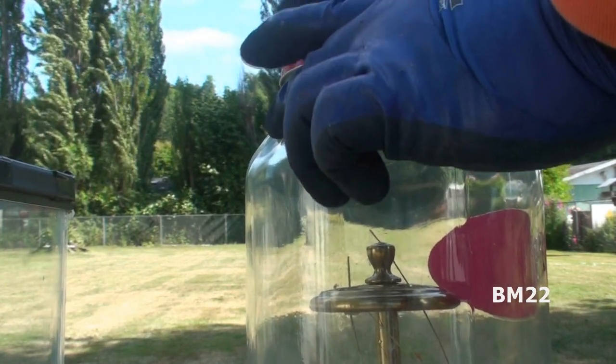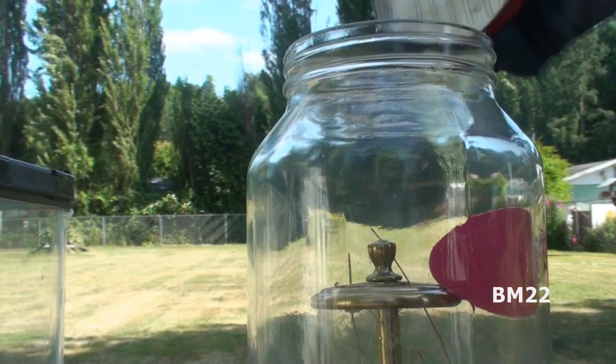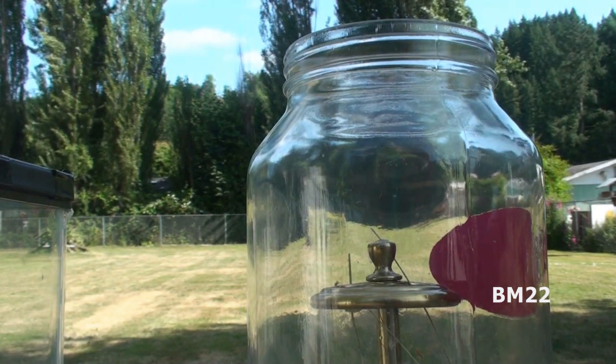Now the second tank, which is the spider jar, the Black Widow spider observation jar, we're going to remove the egg sack from there.